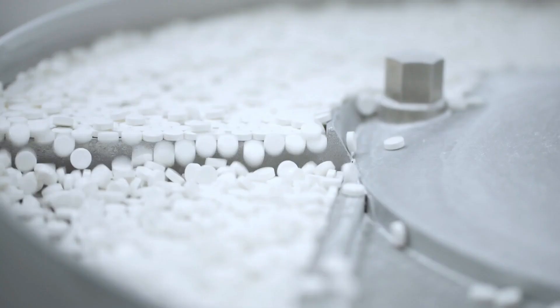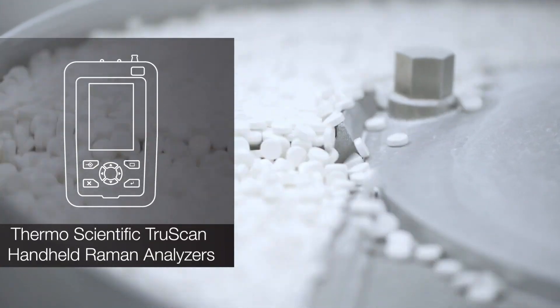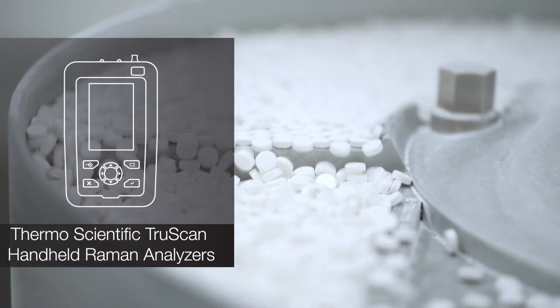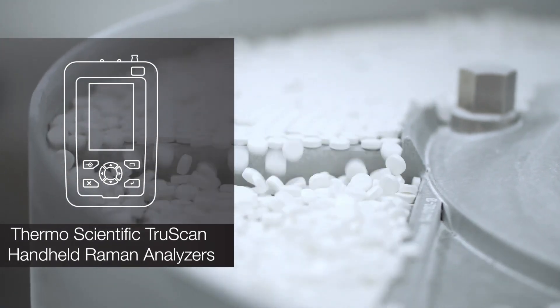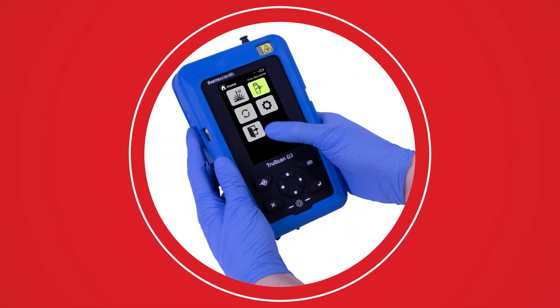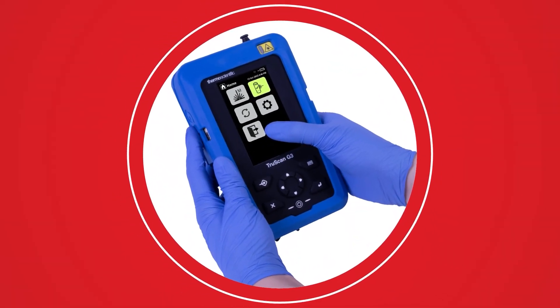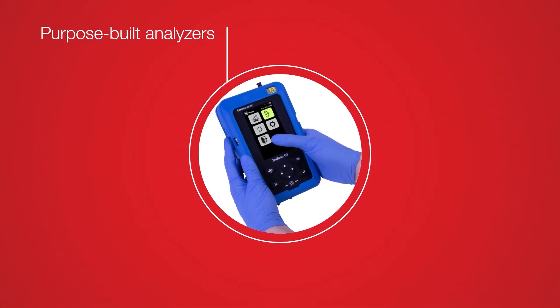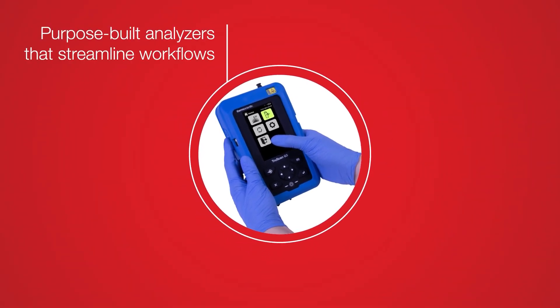For the past 15 years, over 3,000 Thermo Scientific TruScan handheld Raman analyzers have been performing material identification in the pharmaceutical manufacturing field, bringing the lab right into your hands. The TruScan G3 handheld Raman analyzer builds on that legacy of simple and purpose-built instruments that streamline workflows and protect brand integrity.